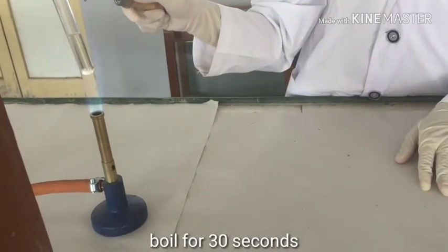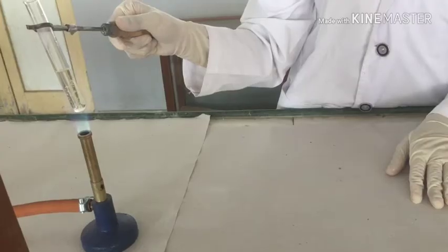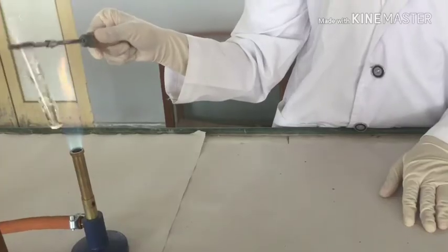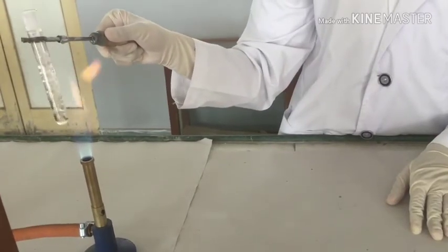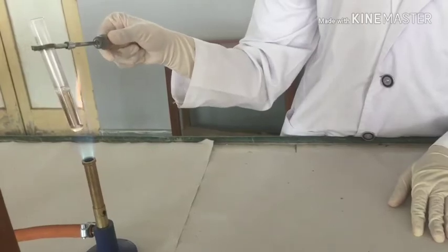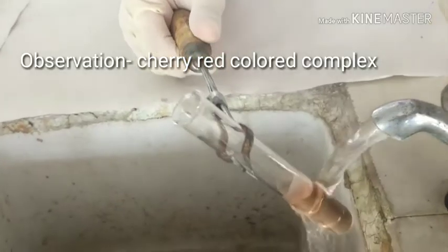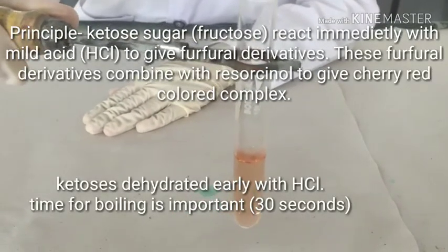Shake the test tube while boiling it. Cool the test tube under tap water. There is a formation of a cherry red colour, which indicates a positive Seliminov test.